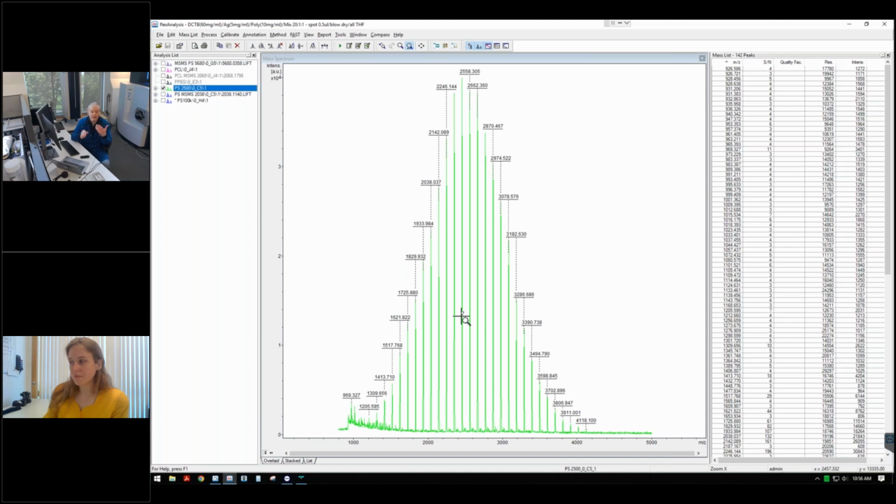So if you had only 5 milligrams of total sample, you could put that in the solution. And again, you're only pulling a 2 microliter aliquot or 4 microliter aliquot from that solution. And then the rest of, 100 microliters or a milliliter, you're retaining 998 microliters of a 1 mil solution. So again, very small amounts. So you don't even really need to dissolve all that much.